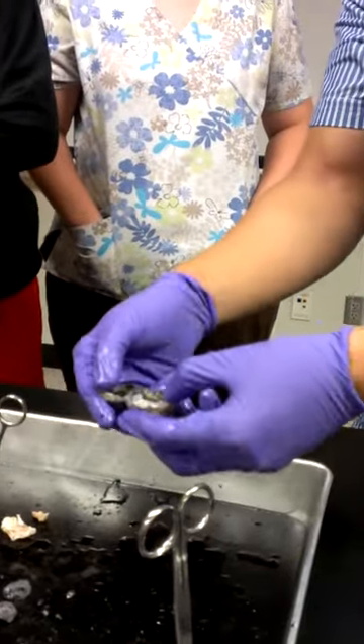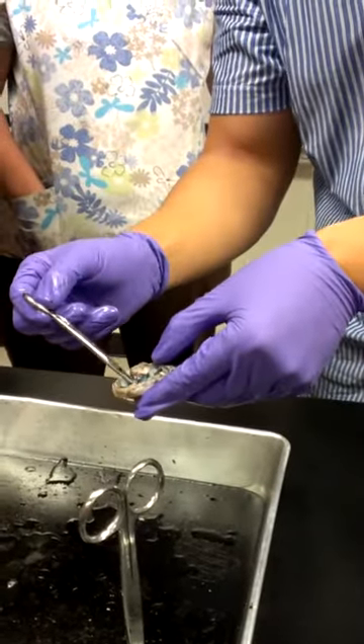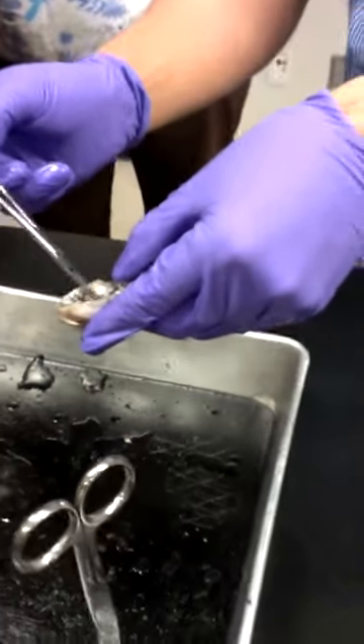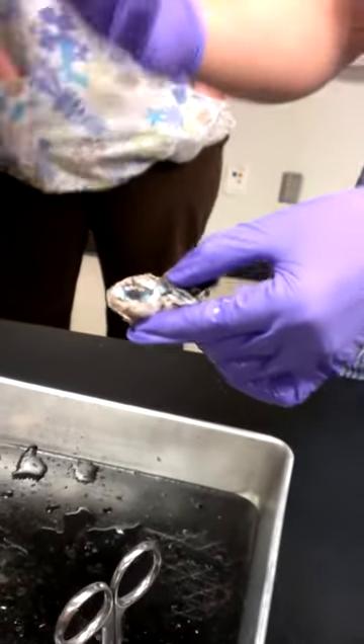When you guys look into this — this is an animal eyeball — you can see that in the back of the eyeball, basically where the retina is, there's this kind of thin film. That's the retina. And then on the back, there's going to be this kind of bluish-green color — sometimes more shiny, sometimes less. That's actually called the tapetum lucidum.